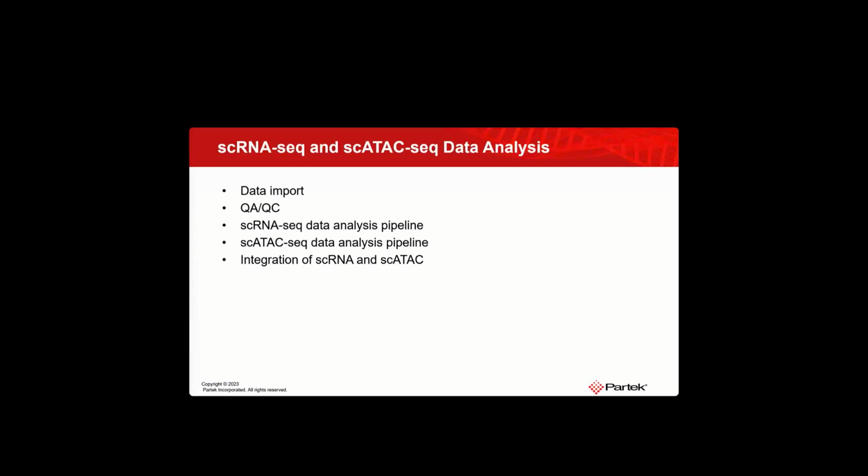Today we're going to talk about single-cell RNA-seq and single-cell ATAC-seq data analysis and integration. I will talk about how to import the data and QC the data. We're going to briefly talk about the single-cell RNA-seq data analysis pipeline. For more details, you can refer to the single-cell RNA-seq data analysis videos. We're going to focus more on the single-cell ATAC-seq data analysis pipeline, and how to build that in Partek Flow. And at the very end, I will show you options for how you can integrate those two assays.